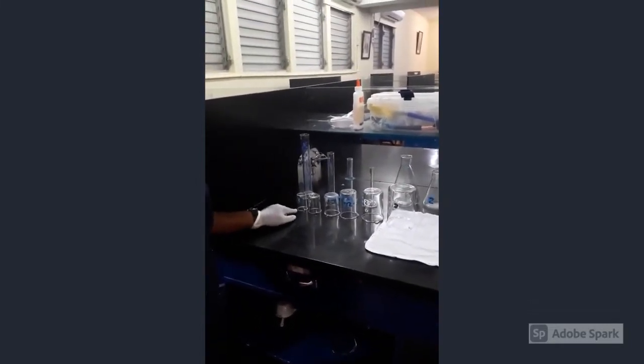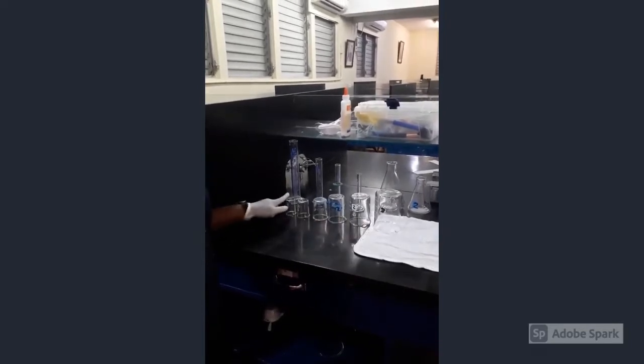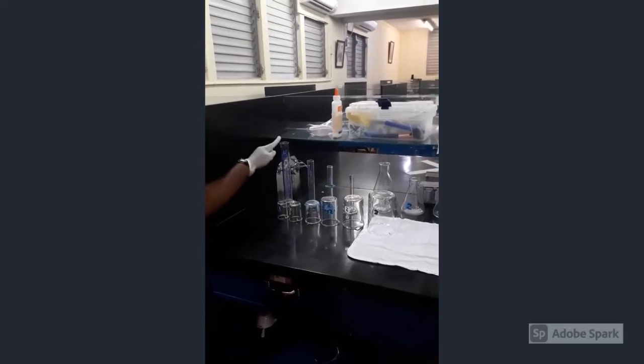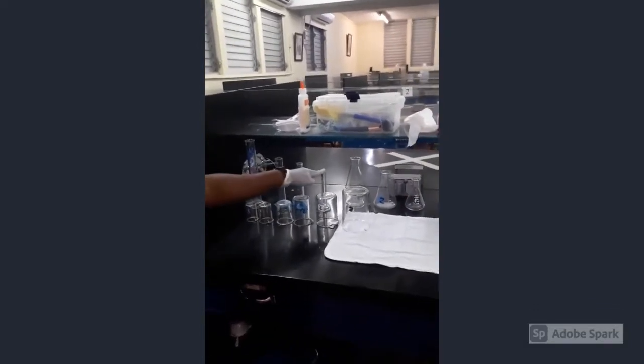We have our beakers from size 30 to 800 mils, and our measuring cylinders from 100 mil to 10 mils.